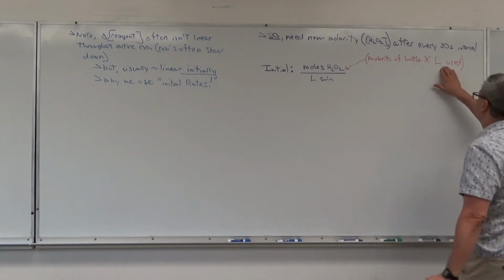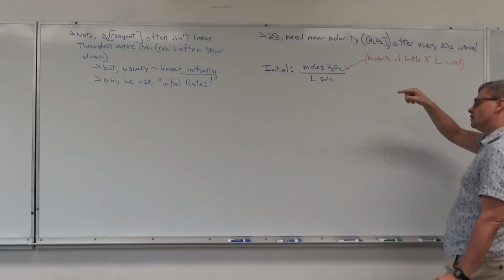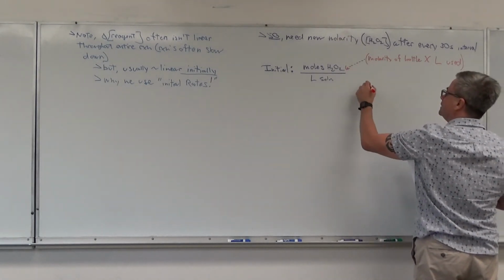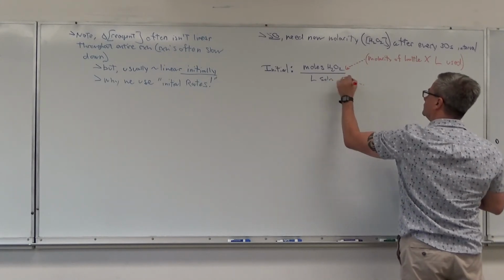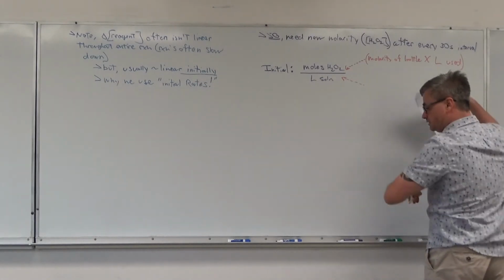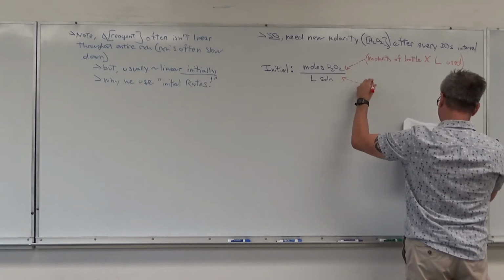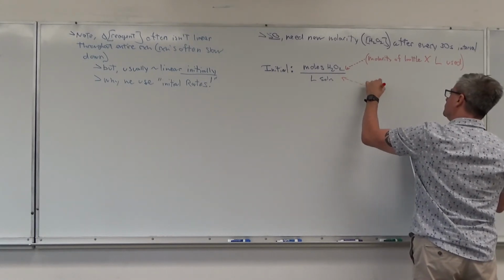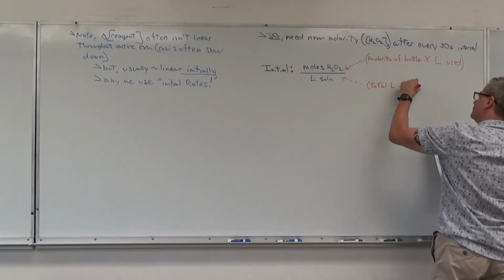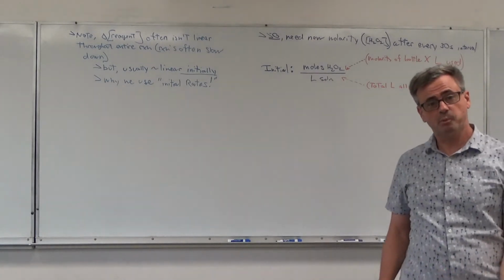Anyway, however many liters we pour in there to initiate the reaction, times the molarity on the bottle, which is 0.88 molar. Okay, and then gotta remember to add up the total liters of all three things you're putting in there: hydrogen peroxide, potassium iodide, water. Okay. Total liters, all three solutions, which, as I mentioned, is always 0.060.